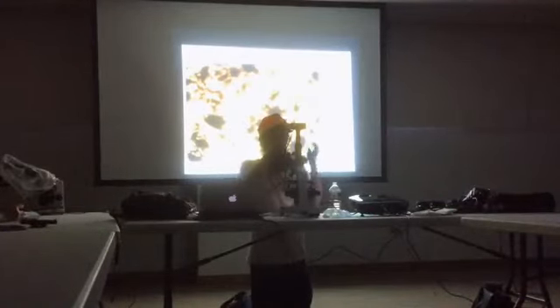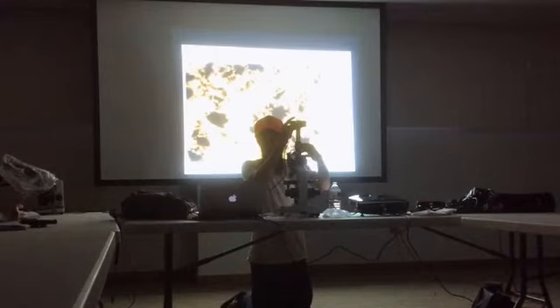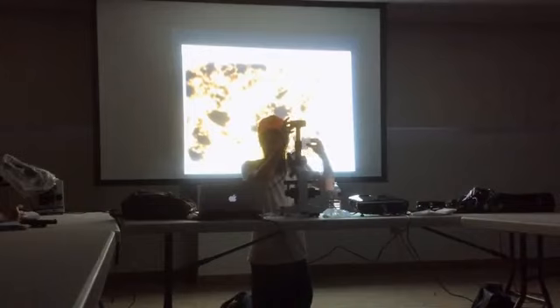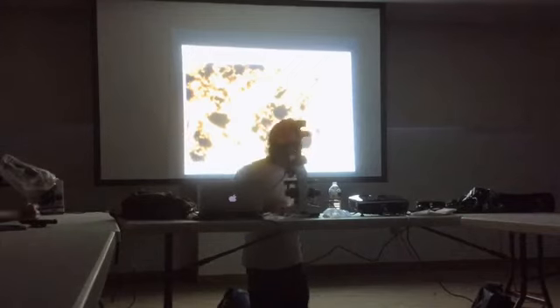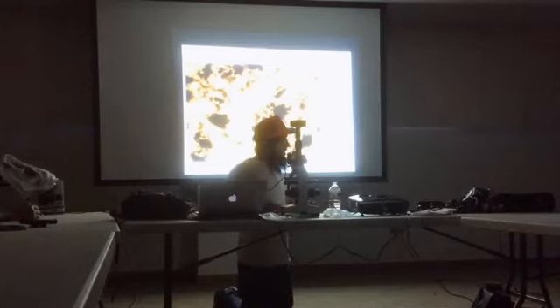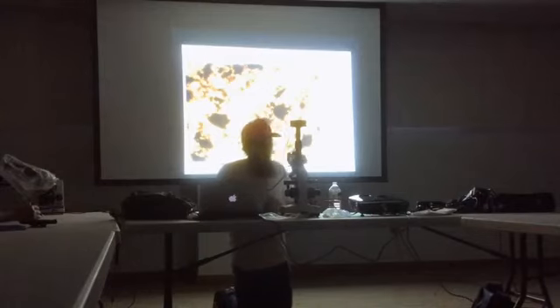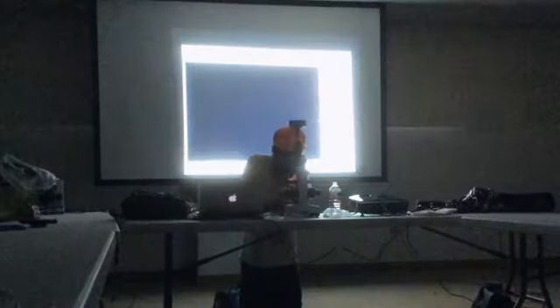So, let me see. What magnification do you have right now? What power are you on? Right now, I'm looking at it at 100 times. Okay. This sample is pretty dirty. It didn't aggregate very well. I was looking for some nematodes, but I found this right here.